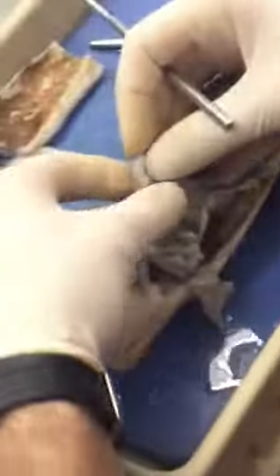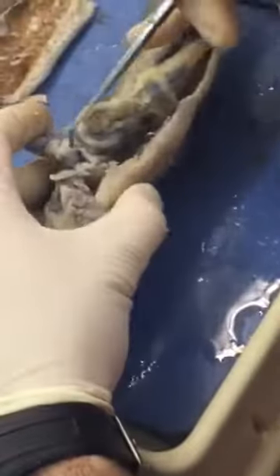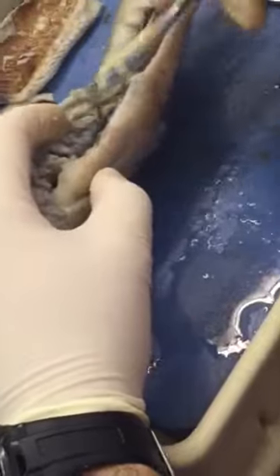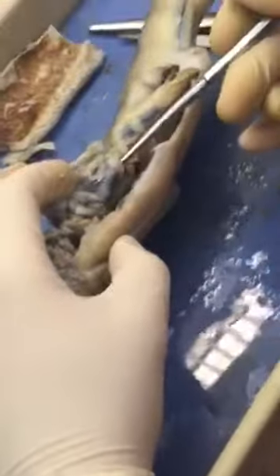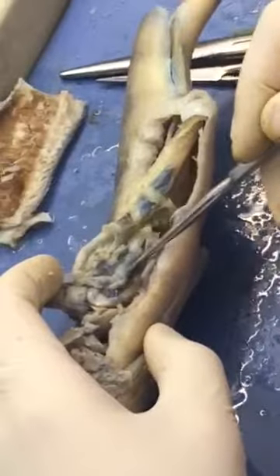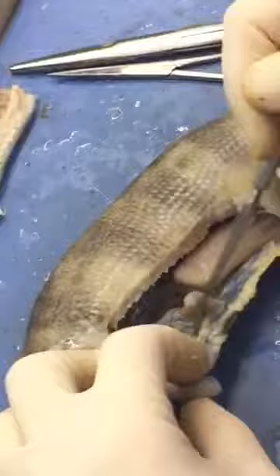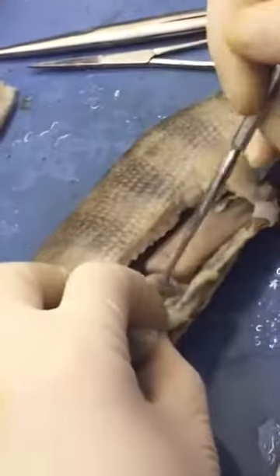Now we can move this all out of the way a little bit. From the stomach, we see the intestines looping around here. You can see the stomach and the intestines looping around — that will help you find the cecum. You can see this is intestine right here, and the cecum should be coming off of there; I just don't see it very clearly in this one.